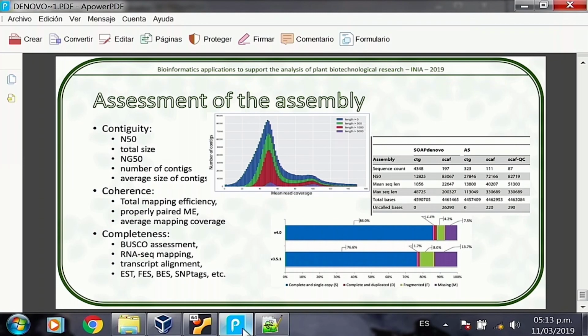The main thing is that we look for it using an algorithm kind of like BLAST. It allows for certain differences between the original database that you're looking for and the actual sequence that you get. So the way these essential genes are found is flexible enough to find a sequence where divergence is high, but the function remains. That's the way this assessment is done.